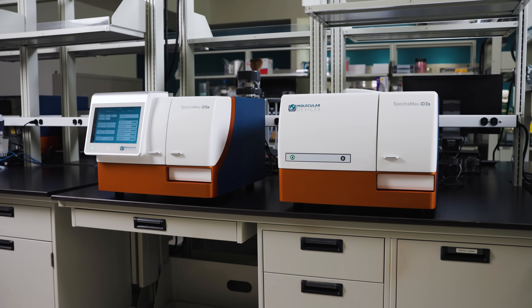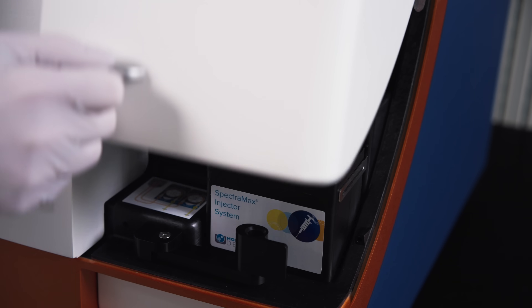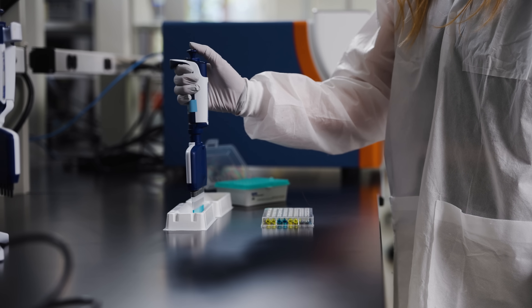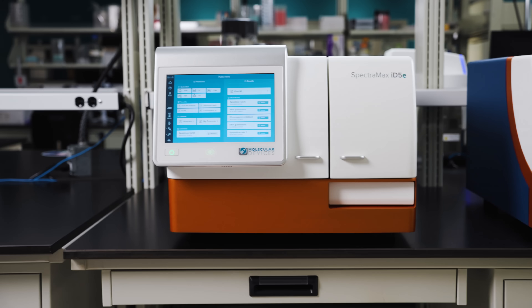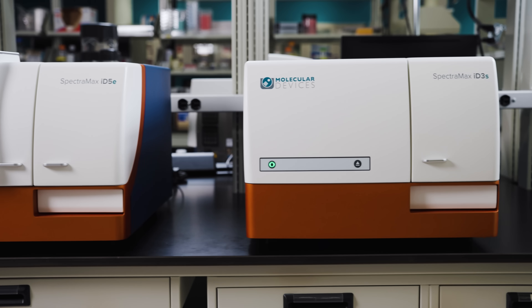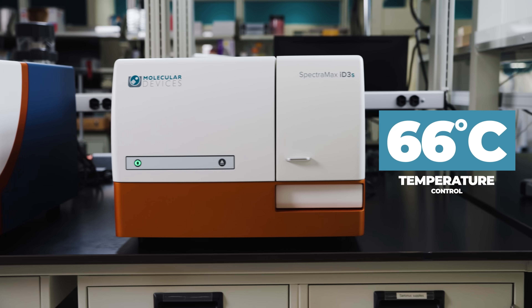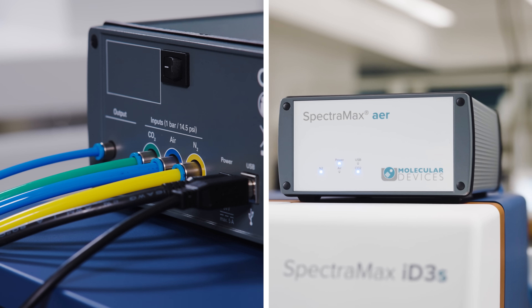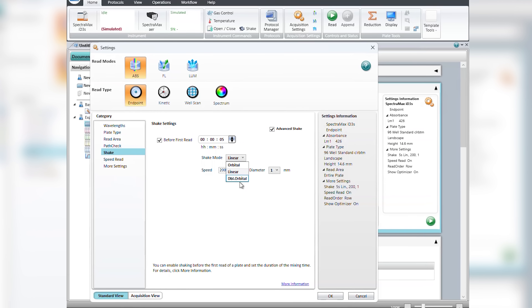Both readers are equipped with C-height optimization and Smart Inject technology to ensure accurate results, even with minimal sample volumes and fast reaction kinetics. The ID series is also ideal for live cell and microbial assays with temperature control up to 66 degrees, and new optional upgrades for environmental control with CO2-O2 gas mixing and advanced shaking.